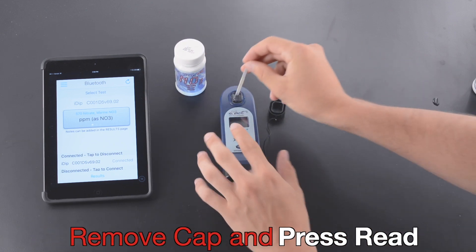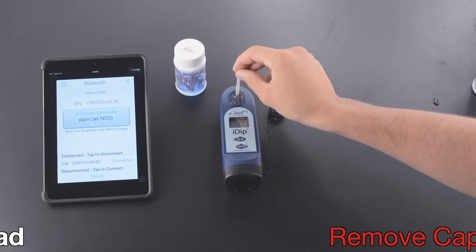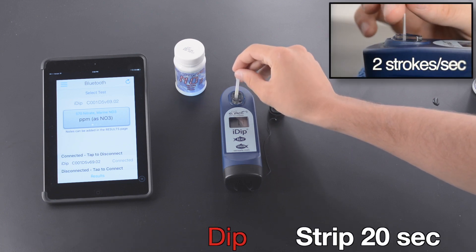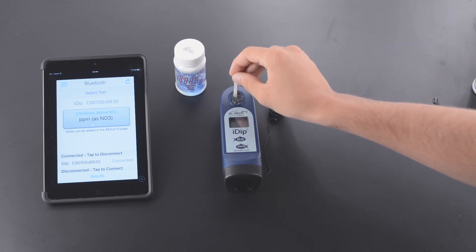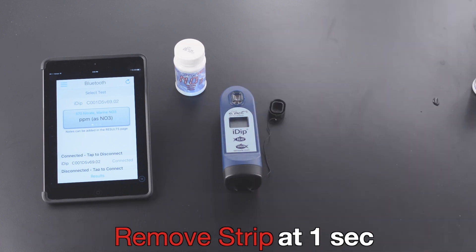Remove Cap and press Read. Dip Strip 20 seconds at two strokes per second. Remove Strip at one second.